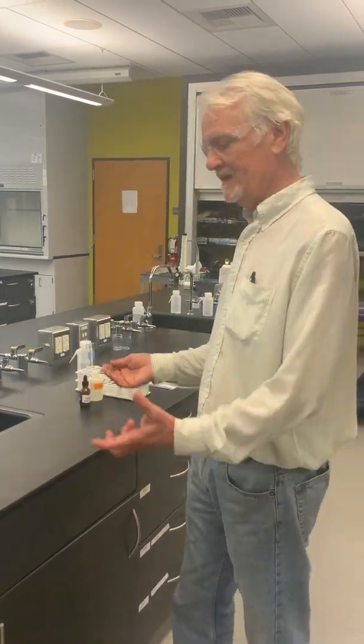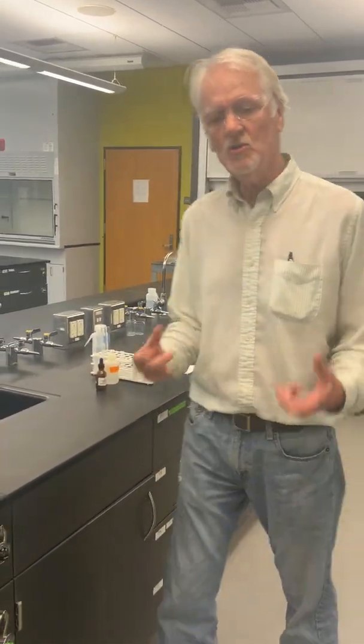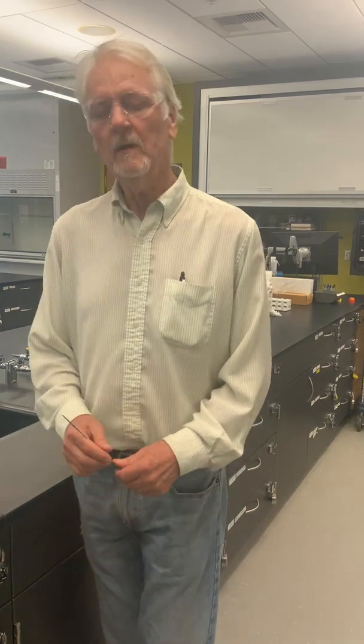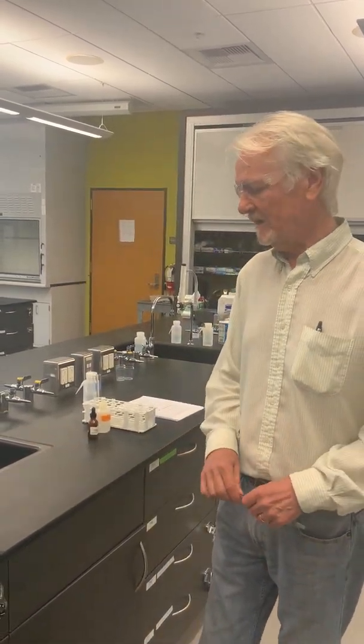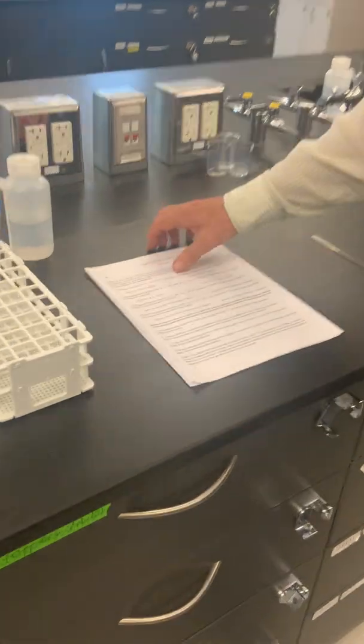You probably have gone through those as well. And so today the idea is to show you an example of those chemical reactions with the emphasis on you trying to record observations. You remember that there are 4 general indicators of chemical change: the evolution of heat and or light, the production of a gas, the formation of a solid precipitate from aqueous solutions, and a general dramatic unexpected color change. So as we go through these 7 chemical reactions, you're going to be looking for those general indicators and recording them on the lab.